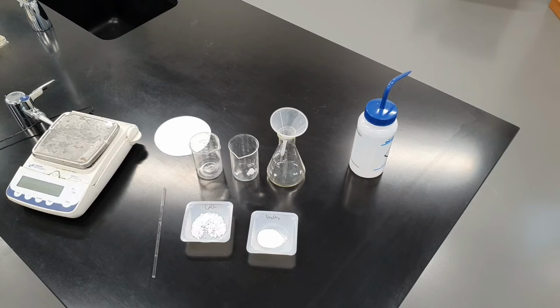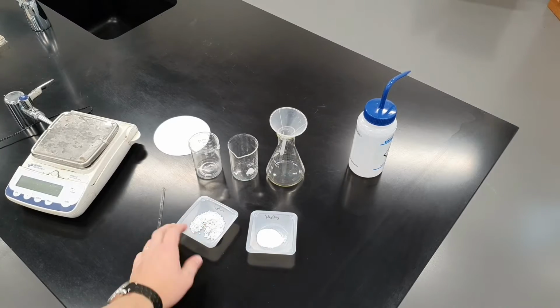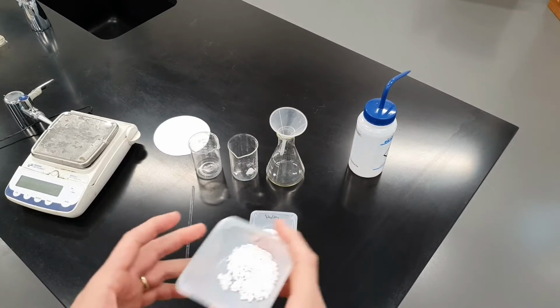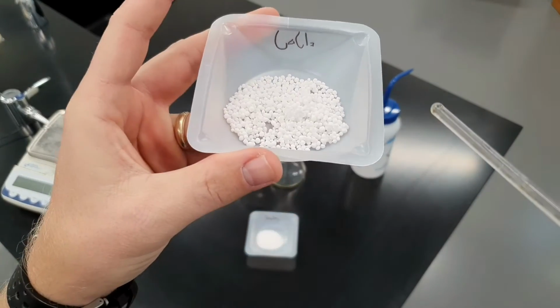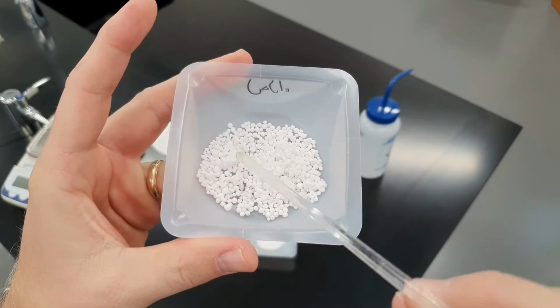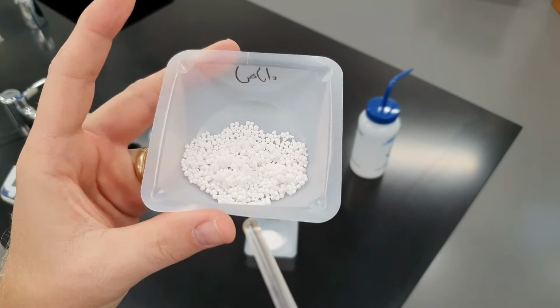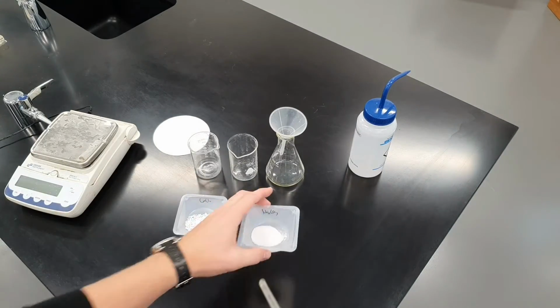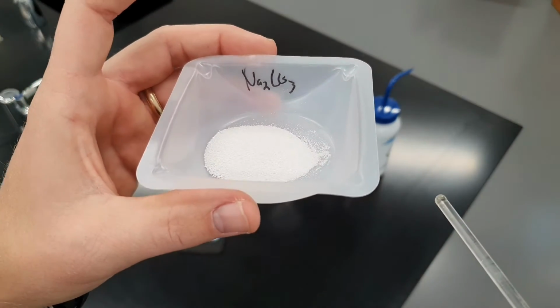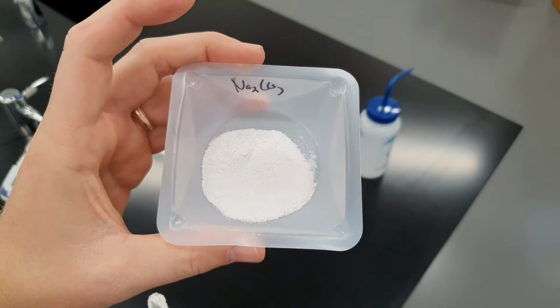Alright, as you're following along with the lab that's online, here's what we've got today. We've got some calcium chloride right here. Let's take a look at what it looks like. It's a white solid, but if you look at it, it almost looks like Dippin' Dots a little bit, if you've ever had some Dippin' Dots. So there's our calcium chloride. And here is our sodium carbonate. It's a little bit finer, a little more powdery looking, like that.